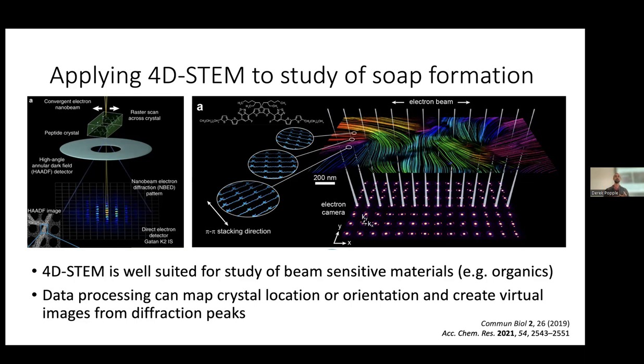The other common form of electron microscopy is transmission electron microscopy, where instead of collecting the backscattered electrons, you bathe the sample in a collimated or parallel beam of electrons and collect the electrons that pass through the sample. So you're looking at ultra-thin samples. Because you tend to use higher accelerating voltages, you can get much smaller resolutions, getting to the point where you can see nanoparticles or even features on a single nanoparticle.